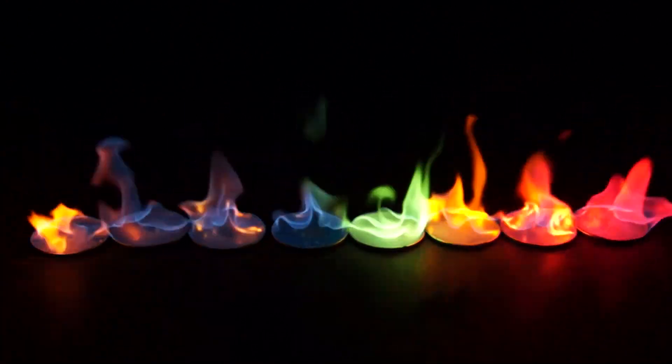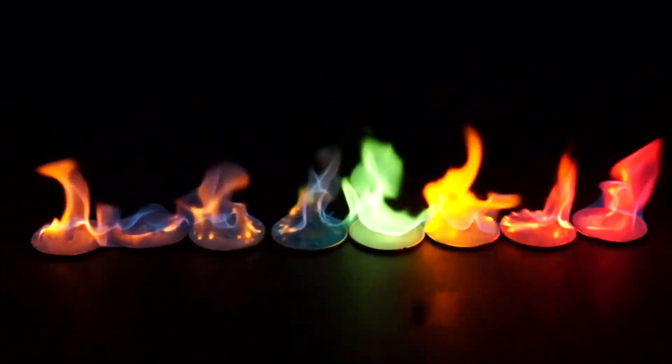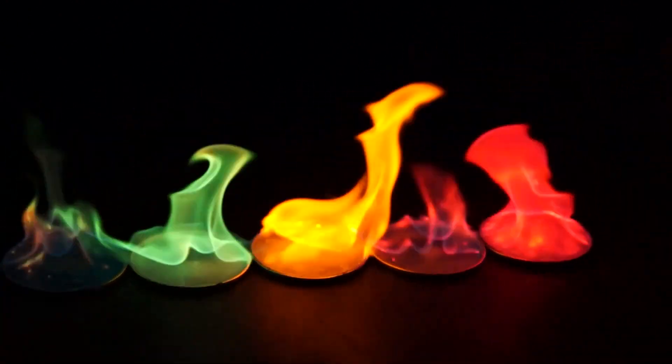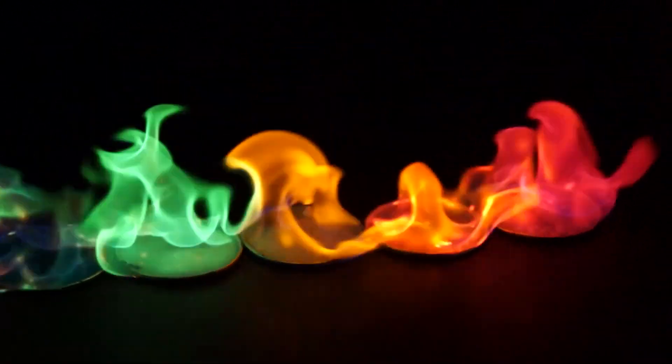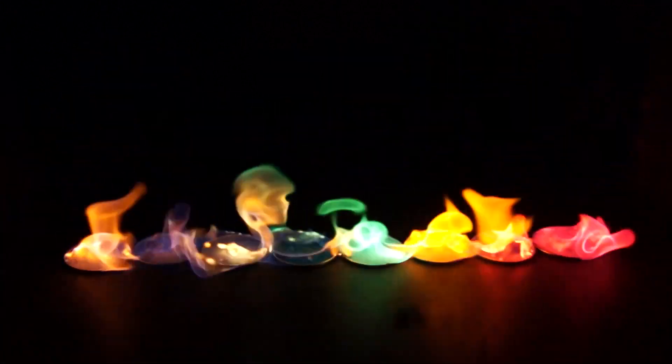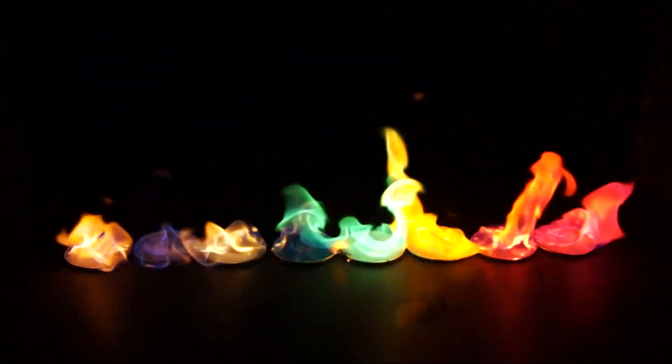Once the flames break out we get a fire rainbow. Lithium chloride paints flame in such a rich carmine red color. Strontium chloride paints the flame in a bright red color. Sodium chloride paints flame in yellow.